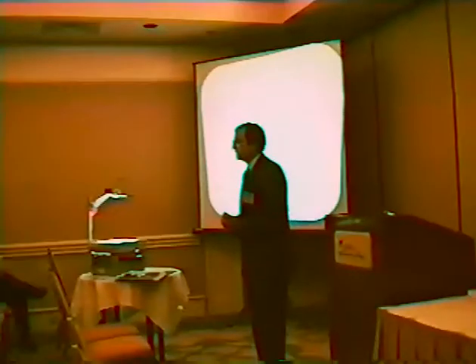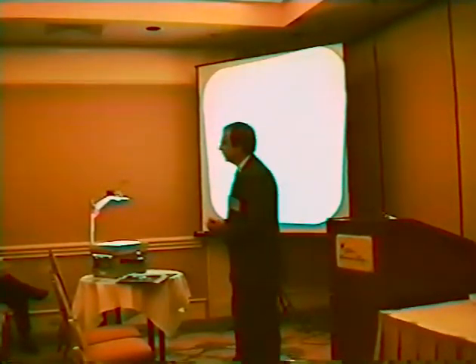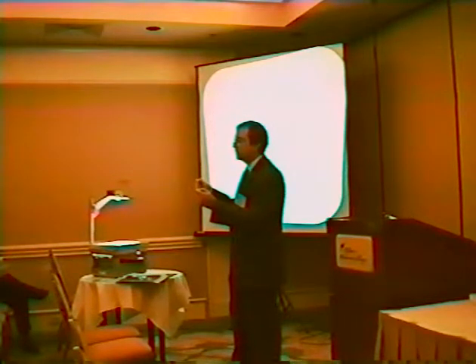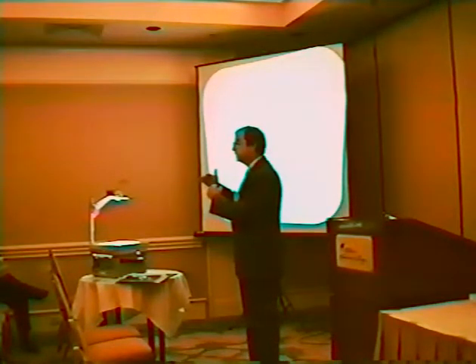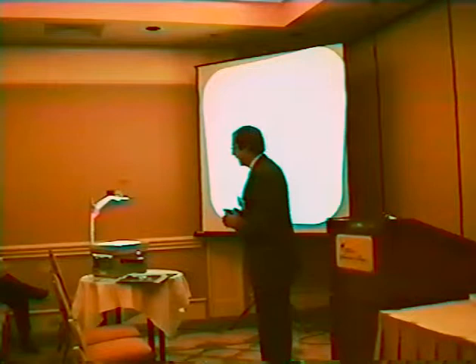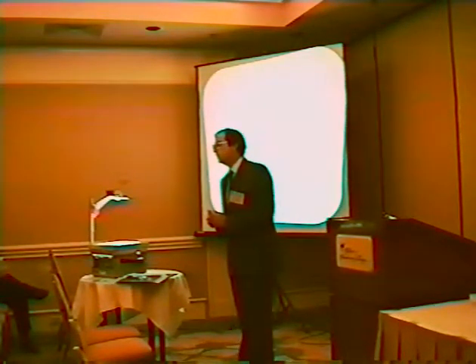The weight of the sample after it's been heated to the final temperature is very, very close to the weight of the sample before the amine was adsorbed. And so there's no residual weight increase in this sample as a result of this reaction. That is, we don't believe there are materials staying on the surface. I haven't done any other characterizations, so I can't comment on how the surface structure might change.